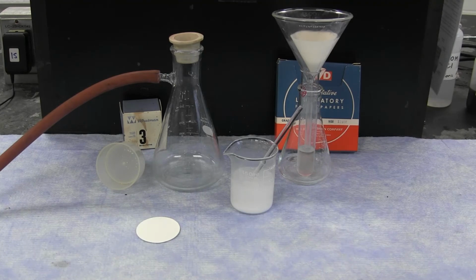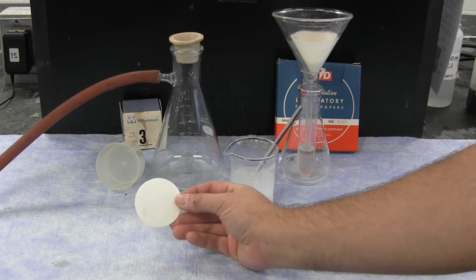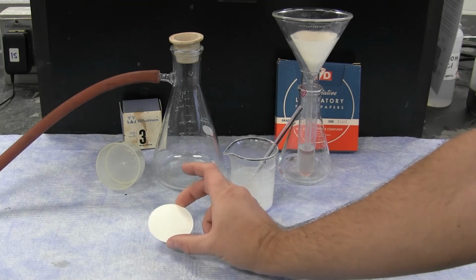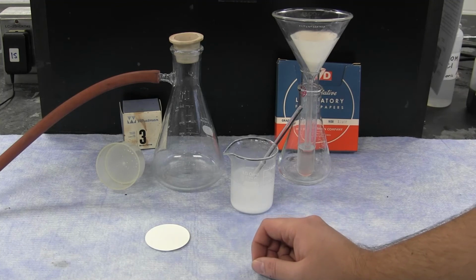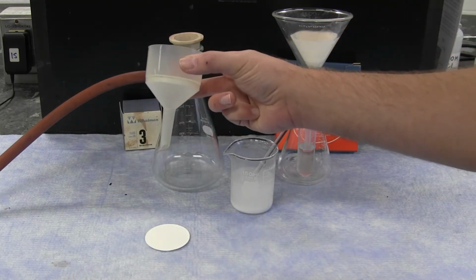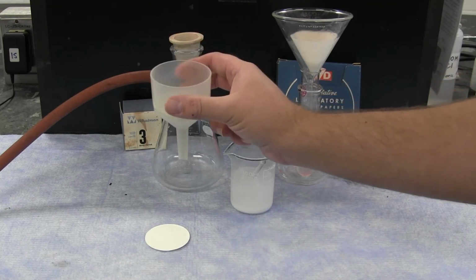The second type of filtration using filter paper is vacuum filtration. In vacuum filtration, the filter paper itself is generally smaller and not folded and stays a whole circle. These circles of filter paper are then used with a special type of funnel called a Buchner funnel. This funnel has straight sides on it and acts like a container.